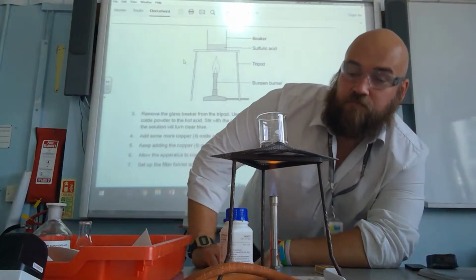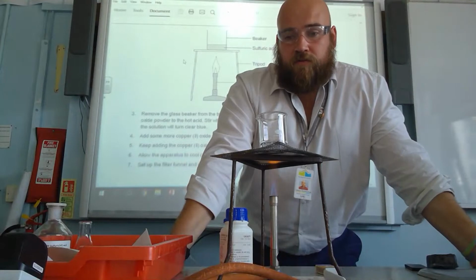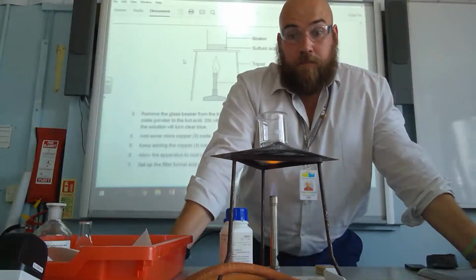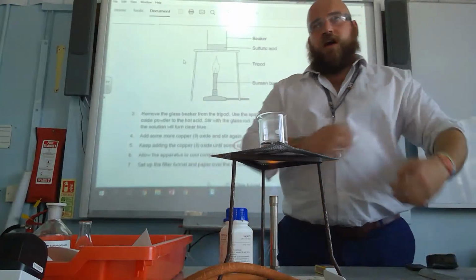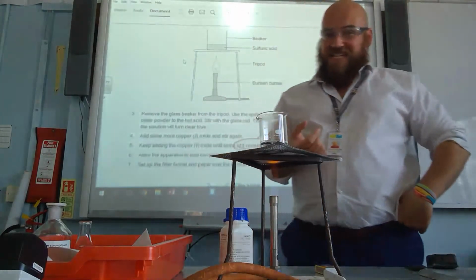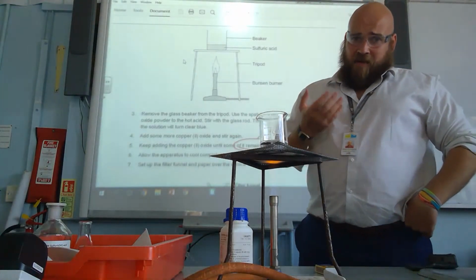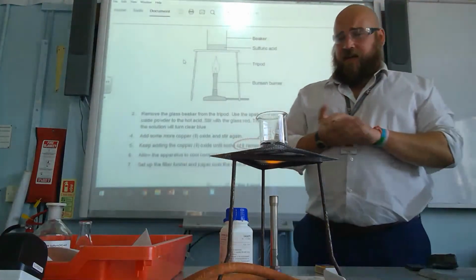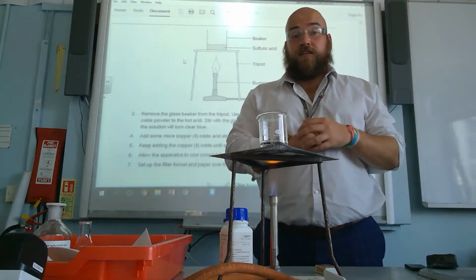Not far now. So this is a really hot acid. And like I say, with sulfuric acid in particular, you do not want to boil this. And especially you don't want to boil it dry. Because if you were to boil sulfuric acid dry, you'd end up with hydrogen sulfate solid, which is just a white powder. And if you continue to heat that, it'll break down and form things like sulfur dioxide and sulfur trioxide, both of which are toxic choking gases.